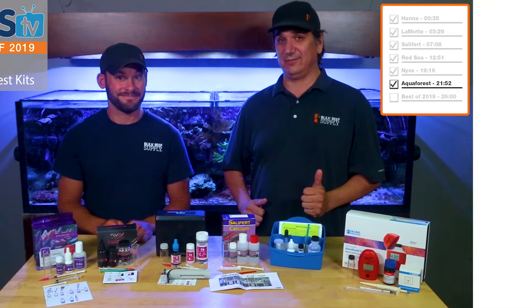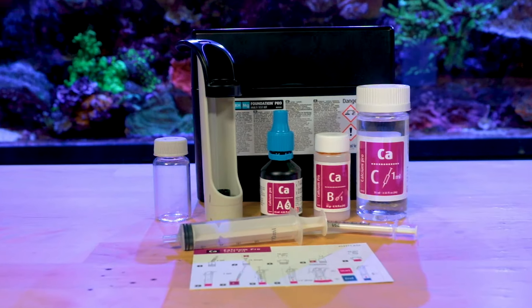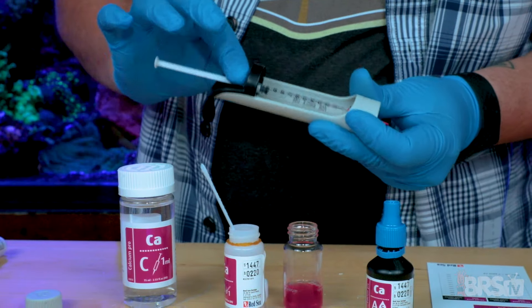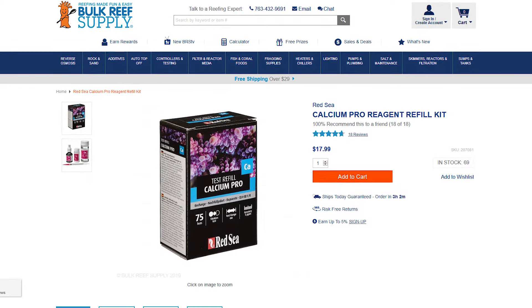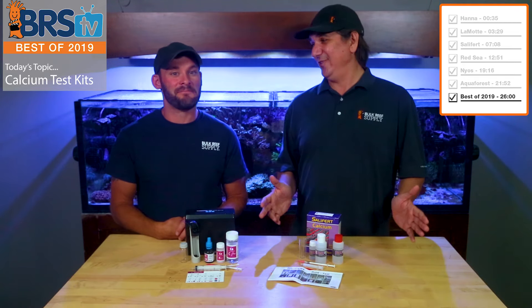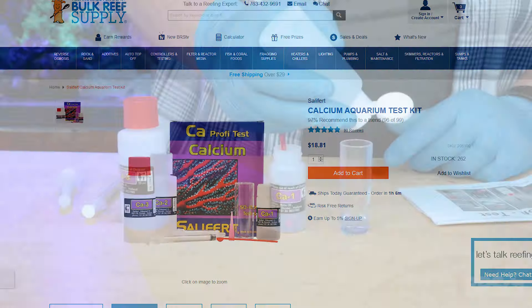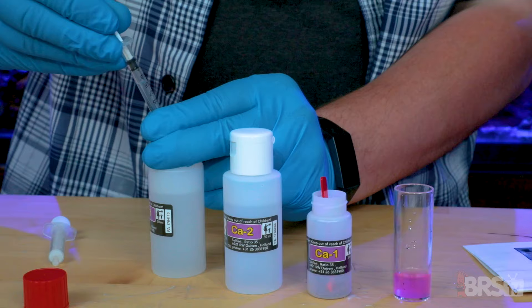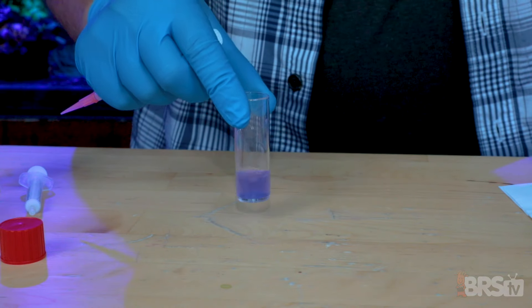Best of 2019: starting with the best in show, the Red Sea test kit for sure. This one takes both thumbs — best in show for 2019. It's got consistency, quality components, it's affordable, not the cheapest but not the most expensive, and it's the one I'm going to use. Best of value for 2019 is undeniably the Salifert test kit — 25 cents a test, relatively consistent, and easy to read. That makes it the most economical choice. Without all the data, when I did this one personally it was actually super satisfying, and I really liked specifically the color change — this could have been best of show.